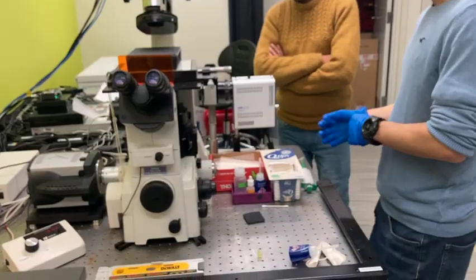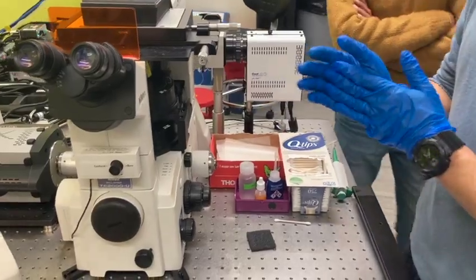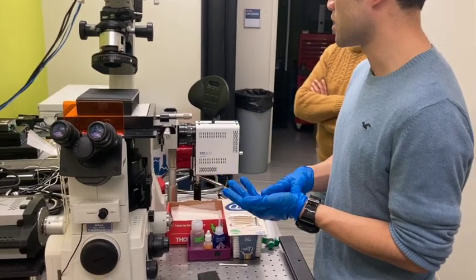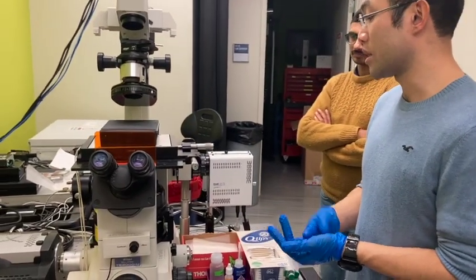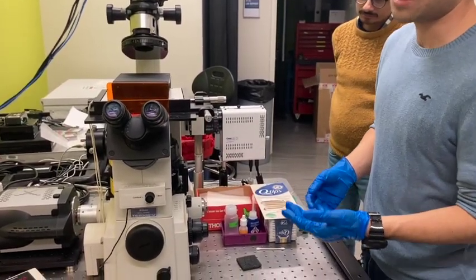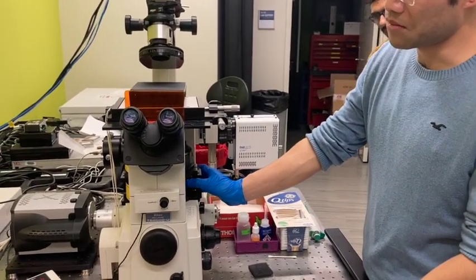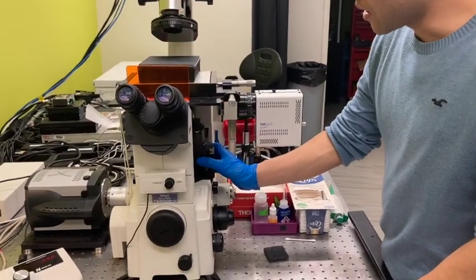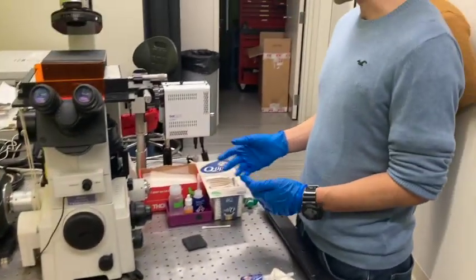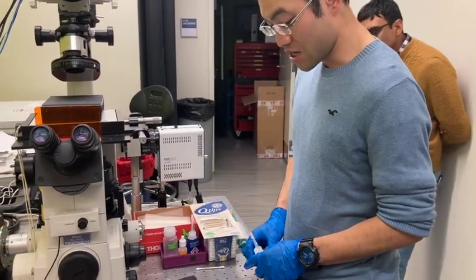And currently we use two-color TIRF, but it's very easy to switch to the other lasers because right now we have three lasers. We have green, blue, and red. In our two-color TIRF, we cannot use green because green will just pass through everything. So if you want to use green, you might need to switch to some other cube filters. And I'm going to make a table of all the other filters so everyone knows the parameters, what wavelength, what size you can use.